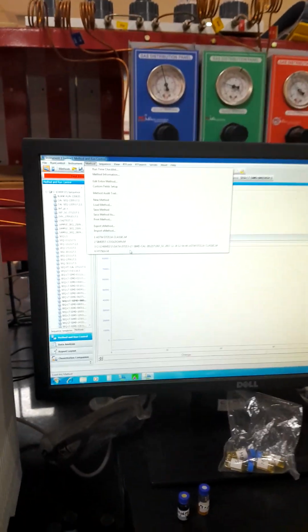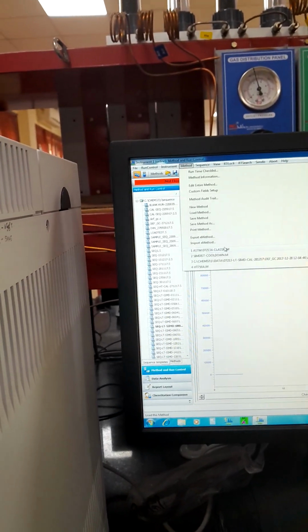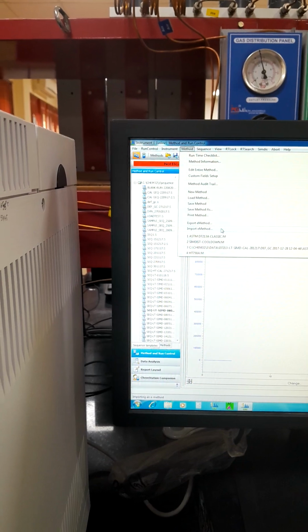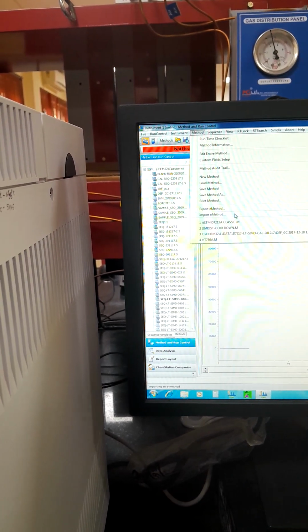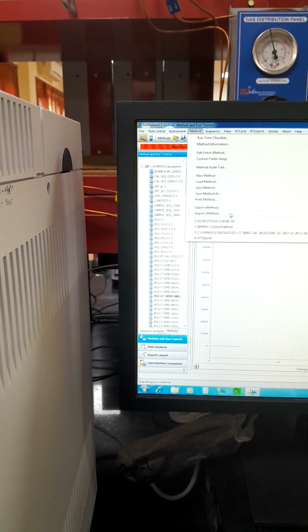If you have some other application, like 7213 or 7169, you have to change the parameters, and then it will go to 7213. It will handle a 25-minute runtime. After that, whenever you go to 720 degrees Celsius, the runtime goes up to 35 or 40 minutes.